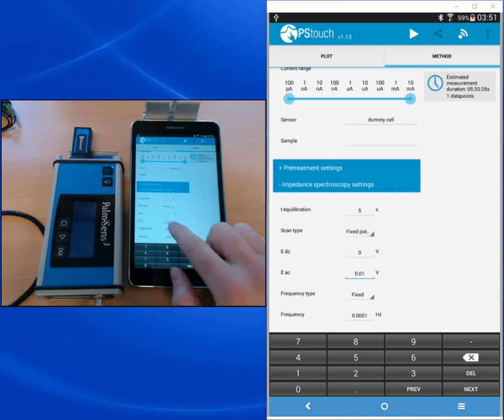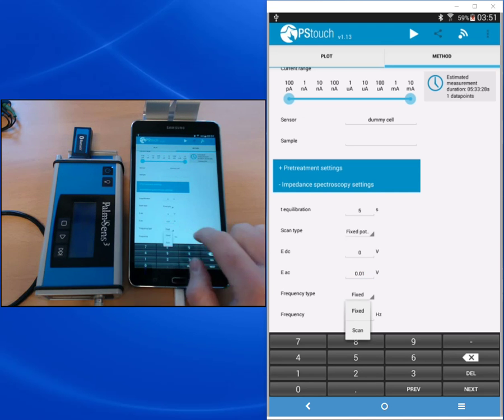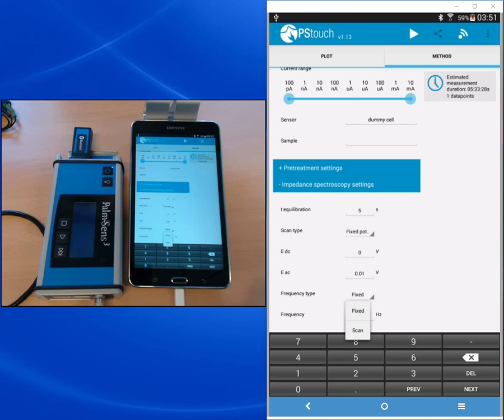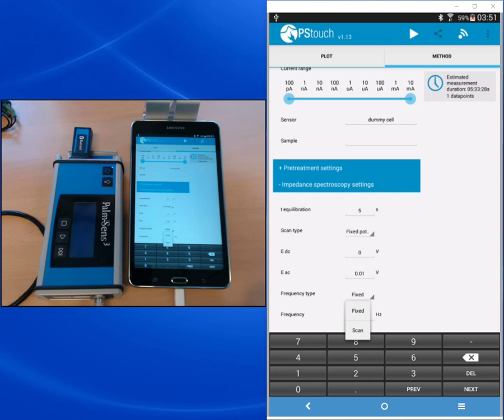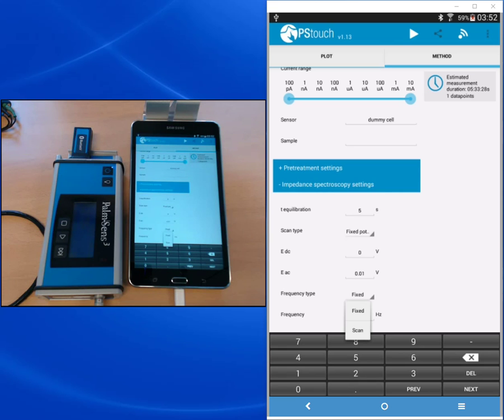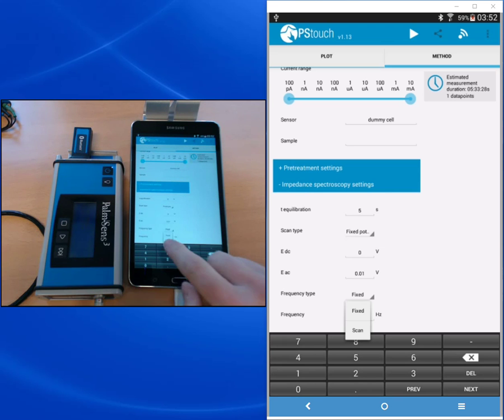Next we can choose which frequency type we want. If we want to have a fixed frequency, so only do a single point of the spectrum. This can be useful if you only want to observe for example a single frequency with a change of potential. Then you would choose scan type potential scan or the change in time. But to get a full spectrum we need to choose the frequency scan type, meaning that different frequencies will be measured and so we get a full impedance spectrum.